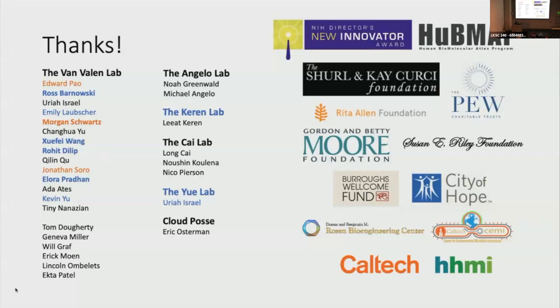So they exist. In some cases you can see systematic errors that happen from taking these classical clustering pipelines and then doing some fine tuning, with a starting point that has some amount of bias in it. We see that, but that's actually not so bad, provided you have enough data from enough different clustering algorithms to start, so that you don't learn those biases. You can sort of average them out.